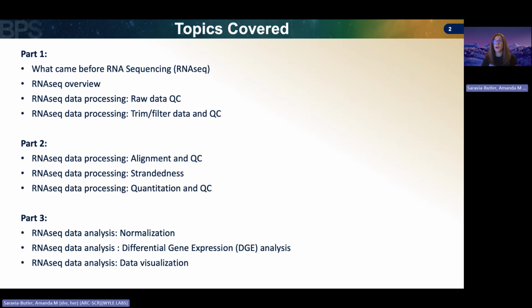Before I go any further, I want to make sure that all of you listening have completed and listened to part 1 of this lecture, and also done the hands-on activity of the Jupyter notebook for RNA-seq processing through step 2C, covering part 1 through our trim data QC.